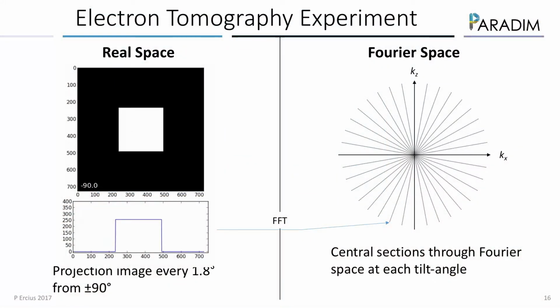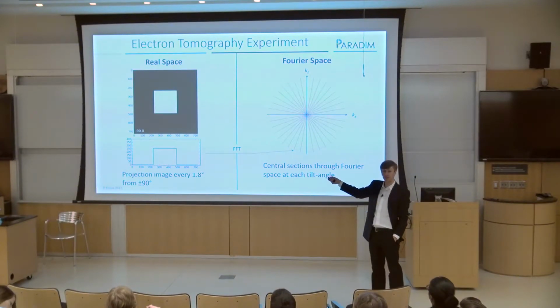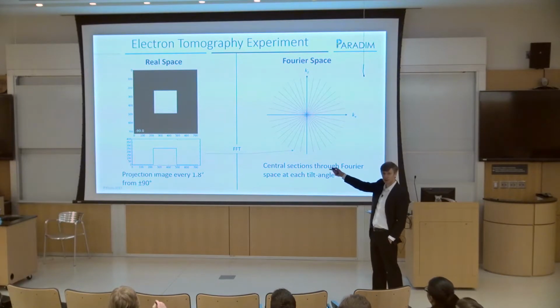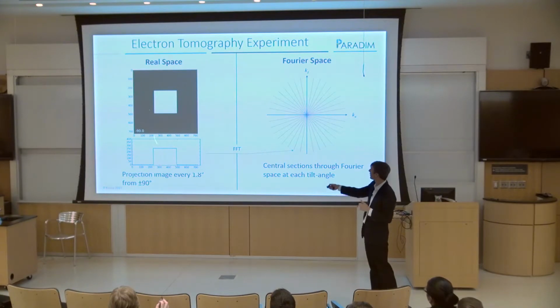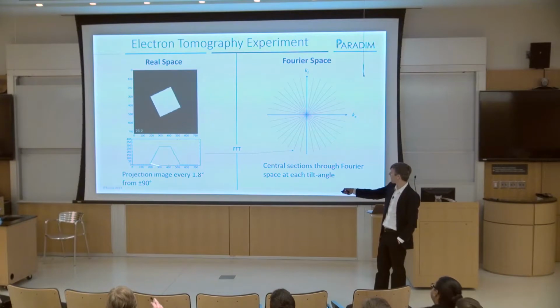So how does this really work? In real space, we can just think of an object like a square. Okay? It's 2 dimensions, and I'm just going to sum along this direction. So at 0 degrees, if you sum, you have 0 here, and then you sum through this. It's about 256 pixels, so we get 256 as we sum through this, right? Because each voxel is 1. So this gives us a thickness of the object of 256 along every single column this way, right?